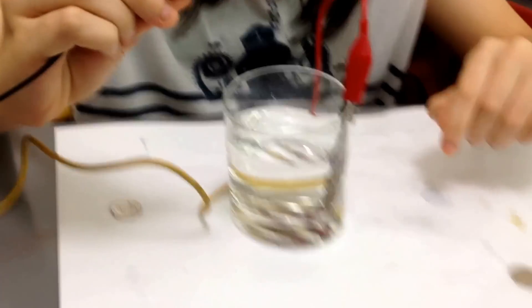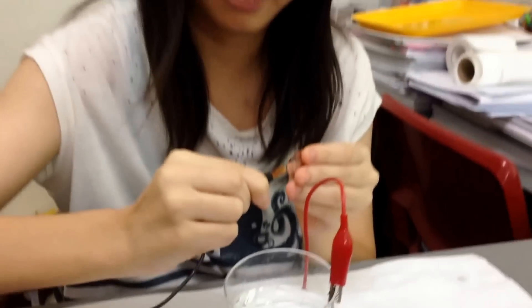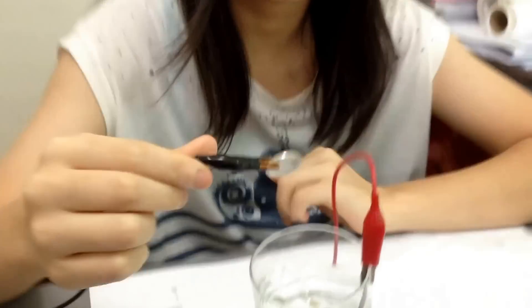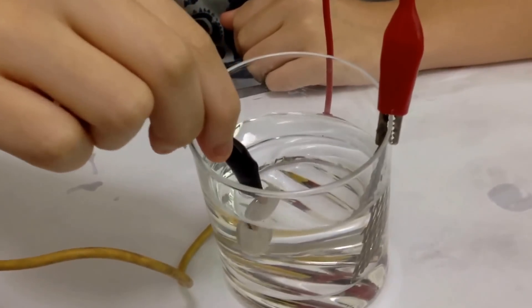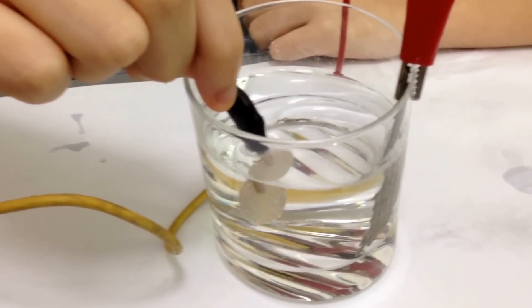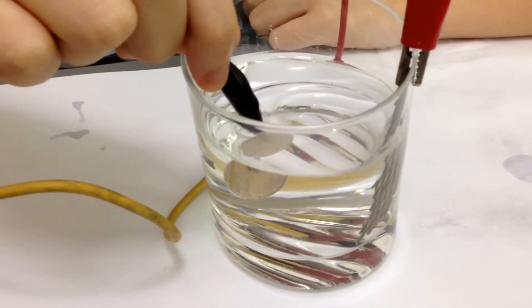Clip the coin onto the cathode, okay, and dip it in. You can see that what is dipped in already — gold and hydrogen immediately forms right now.